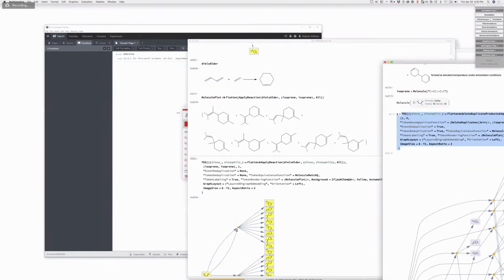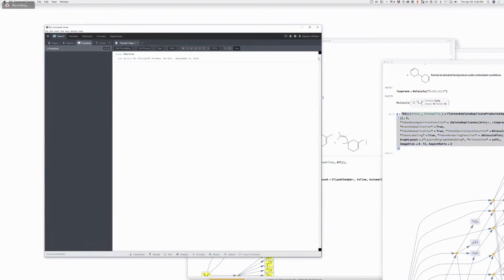Okay, where do I start? So I've got your command center up here, and what would be maybe a little bit of a tour here. So I can pick an experiment, and these are all different. Are these different kinds of experiments? Yeah, everything with the header experiment in the front of it does something physical in the lab. So if it has the prefix experiment, okay, so sample preparation would be.